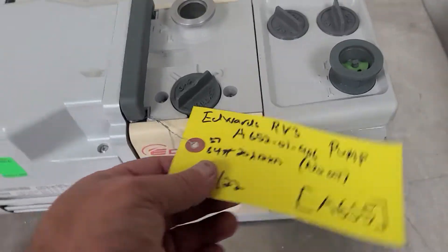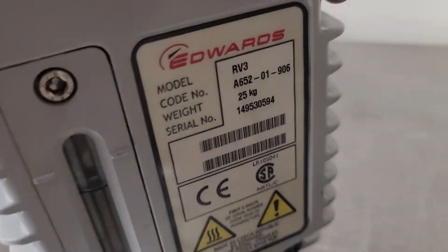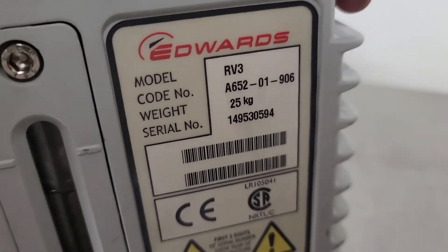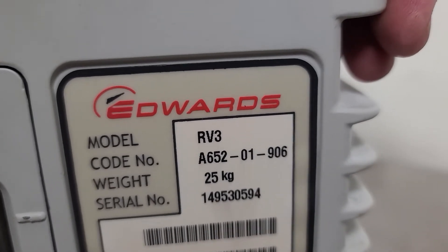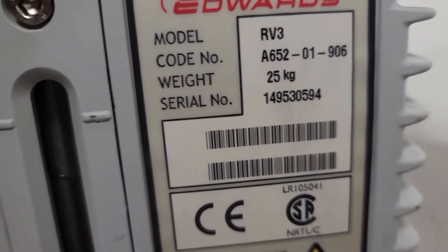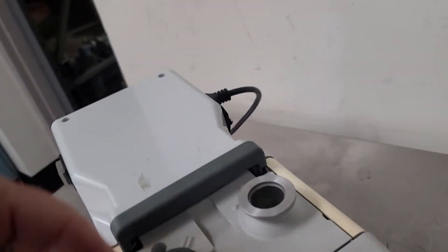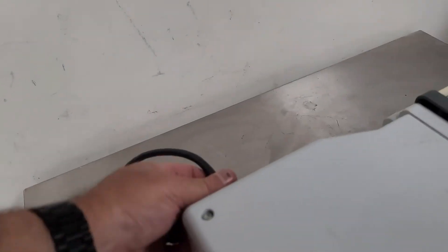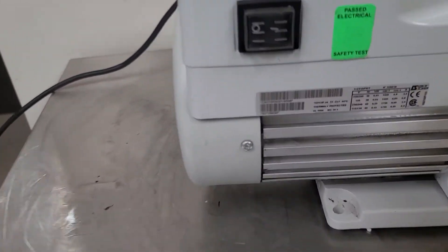This is an Edwards — I think it's an RV3A652-01-906 vacuum pump. It's a number three, 115 volt single phase, takes a standard D-plug. If you need one, let me know — I'll include one, but normally we do not.